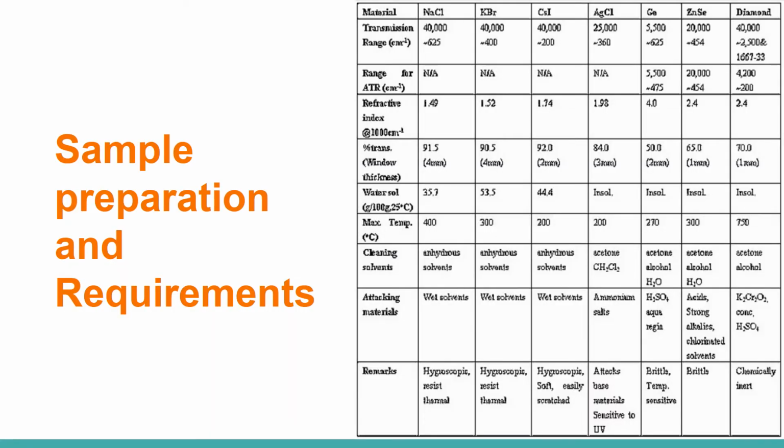So it's your first day as an undergrad research assistant, and Anwar ends up giving you a sample that he wants you to analyze and come up with an accurate estimation of what the sample may actually be. He gave you some Scotch tape as a little reference, a little standard to use. So yeah, it's pretty helpful. You did well in your classes, unlike me, so you understand that having a standard and unknown means you have some leeway as to what machine you want to use.